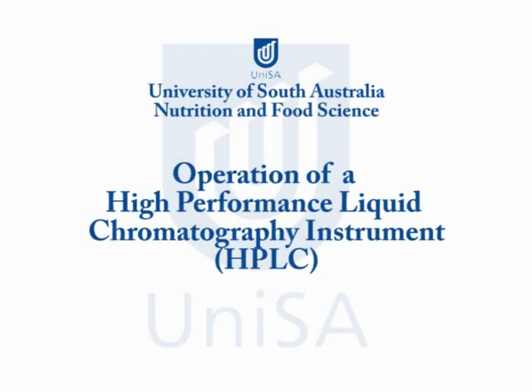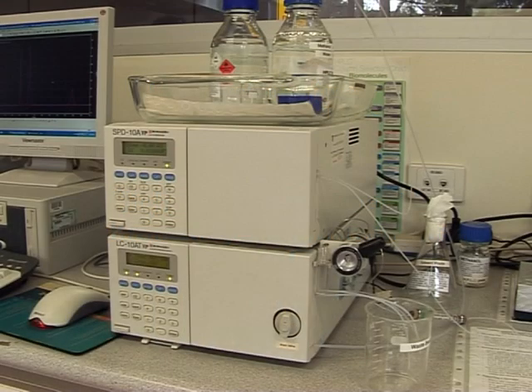Operation of a high-performance liquid chromatography instrument. The instrument will already be turned on for you, and the applicable mobile phase and operating conditions will be set up for you. Both of the HPLC systems may be in use at the same time, so you'll have to select the system that's set up for your assay.